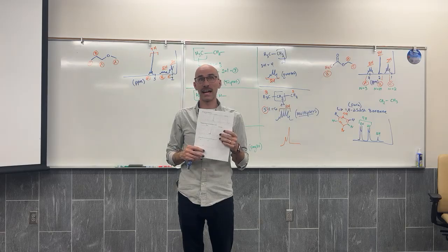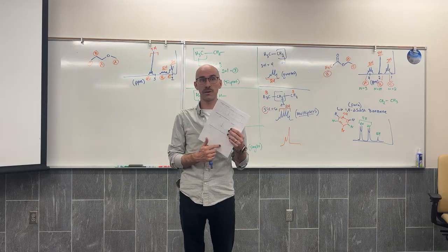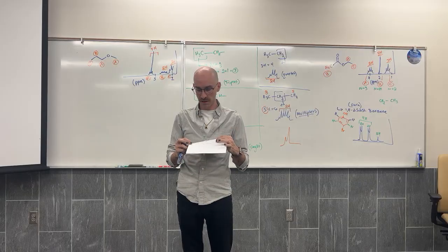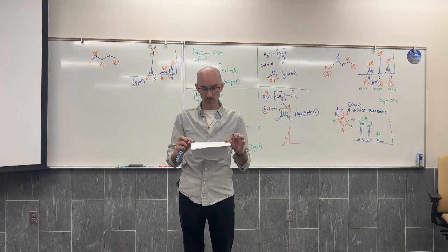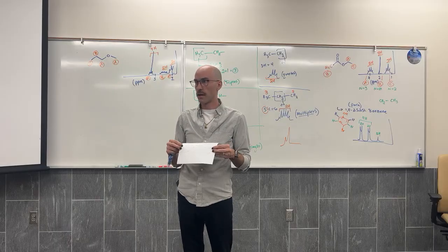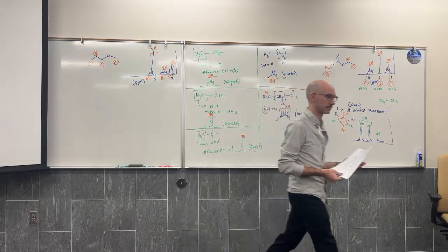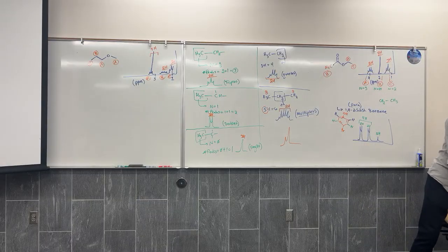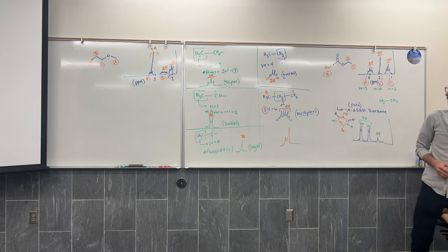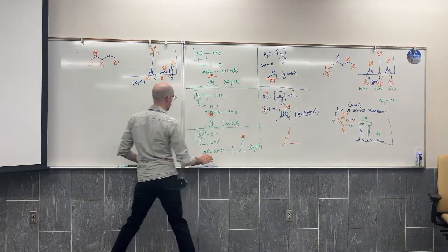All right, the last one, I think I want to come back and solve these with you guys another day. I want to wrap up with something different, but the idea here is to take the chemical formula and devise a structure based on the NMR spectrum. It's almost impossible to do if you don't have a chemical formula, but with a chemical formula, it's a lot easier to do. So, I want to take us on a slight detour.